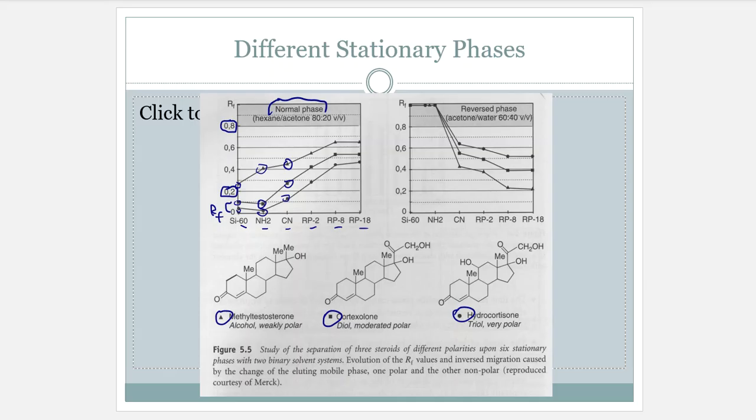So if I go to an RP2, now what happens is that my first component is above a 0.2, my second one is above a 0.2, my third one is above a 0.2, and they all are well below the 0.8 over here to the side. Great, good news. I can use that plate. My spots are a little closer together, but that's never what this has always been about.